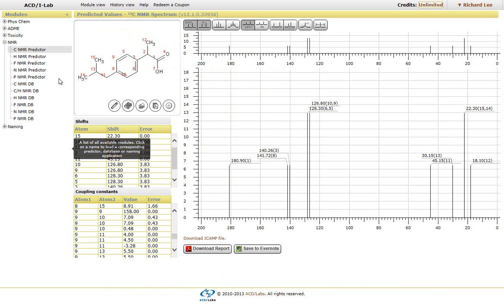Now, if we want to look at the carbon or proton or phosphorus or fluorine nitrogen databases, it's just a matter of simply clicking on the required database.